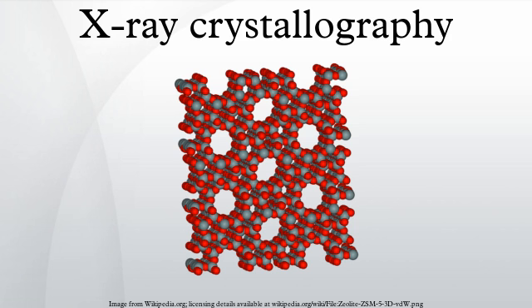Since the amplitude at these reflections grows linearly with the number N of scatterers, the observed intensity of these spots should grow quadratically, like N². In other words, using a crystal concentrates the weak scattering of the individual unit cells into a much more powerful, coherent reflection that can be observed above the noise.